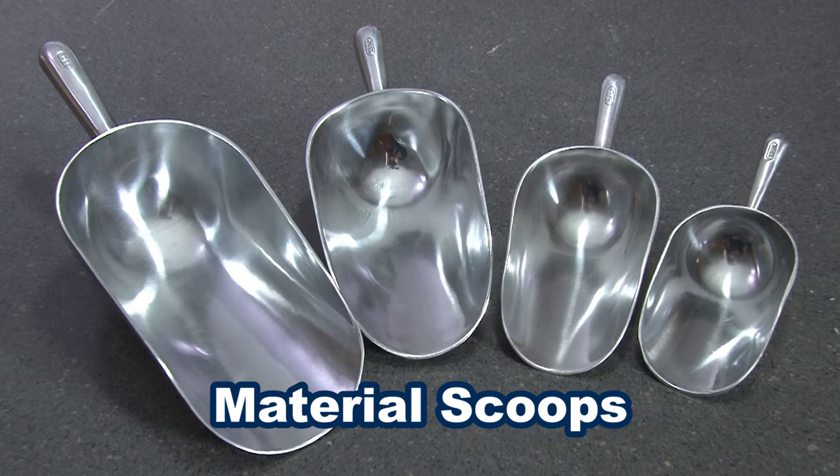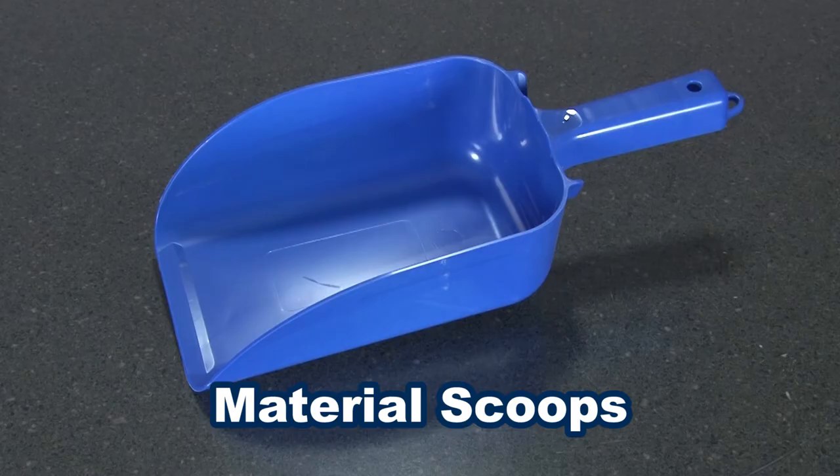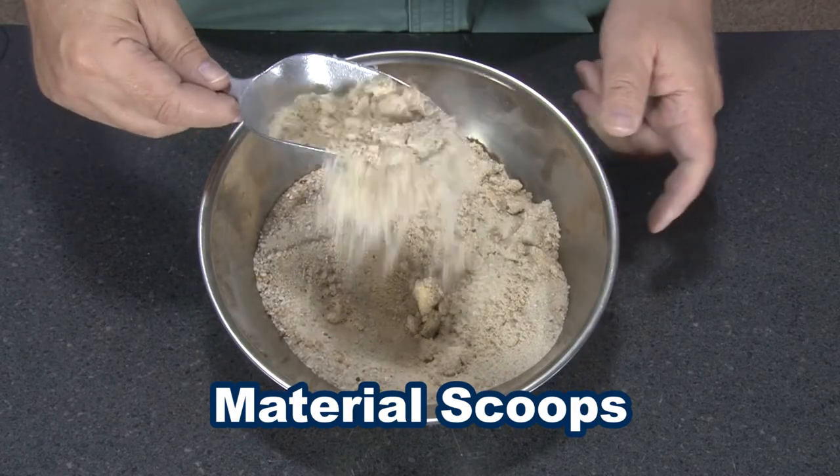Sample material scoops range in capacity from 3.5 to 85 ounces, for both lab and field use. Gilson offers scoops in either aluminum, stainless steel, or plastic, with round bottoms or flat bottoms.